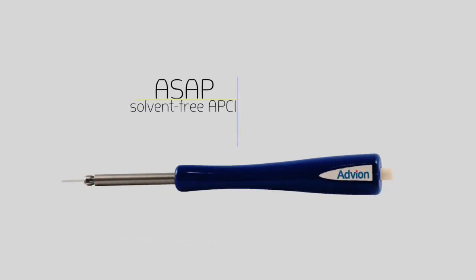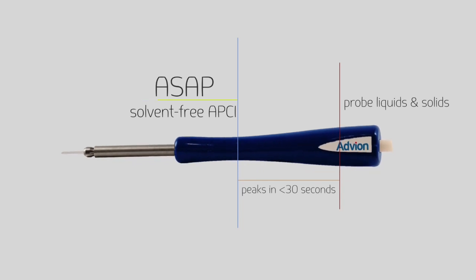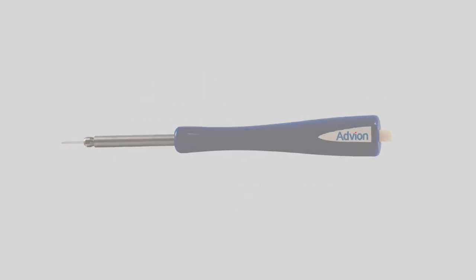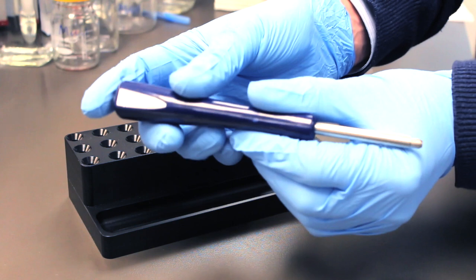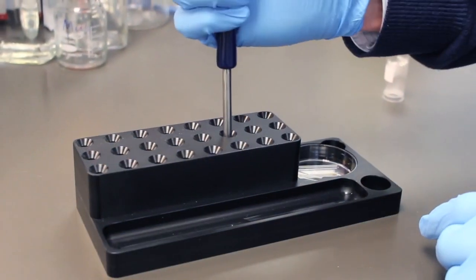The Atmospheric Solids Analysis Probe is one of the latest tools from Advion that revolutionizes sample analysis. The ASAP is a probe developed to obtain mass analysis in less than 30 seconds.